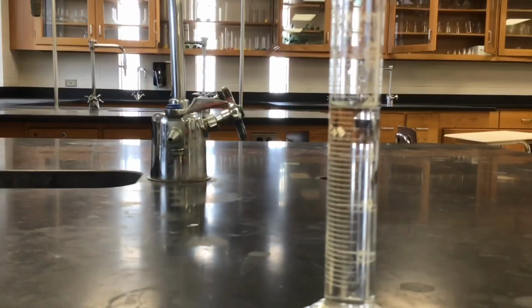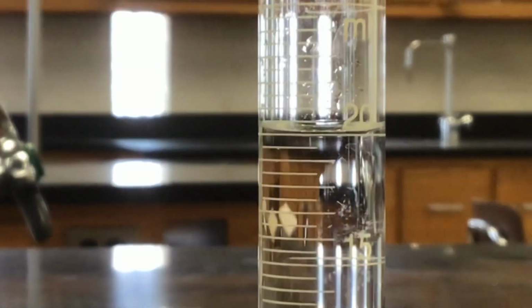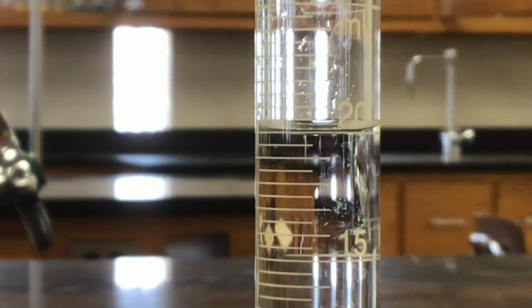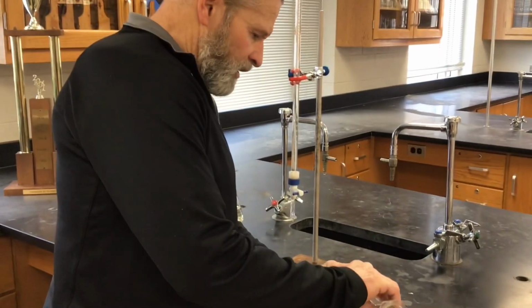Okay, you want to know the volume used. Hopefully it's right at 20 milliliters. Looks like you did a pretty decent job measuring it. Okay. So that's the volume of your strong acid. I'm going to add it to a beaker.